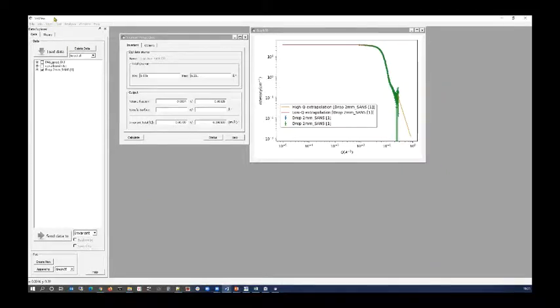And very last thing is just to show you that we have a range of tools in here. You can manipulate data sets, you can calculate scattering length densities. If you have coordinate data like PDB files, for example, you can actually calculate the scattering pattern from the PDB. If you really want to interact with the SasView API, there is a Python shell you can open up to do that. You can load in image data.